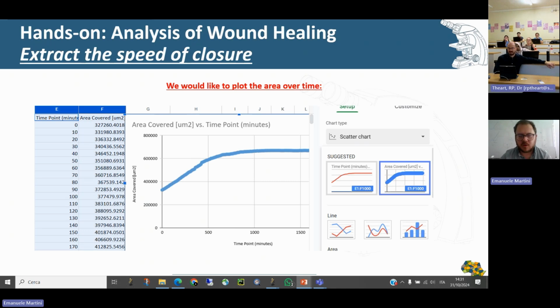Okay, so from here, this is perfect, no? It is exactly what we wanted, of course. This is very good because it's not always like that. Not always what you think you will obtain from your experiment is what you get. But in this case, we did a very good theoretical study, and we were quite sure that the cell area progression would end up something like that.